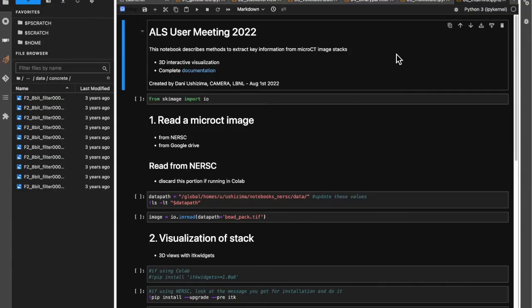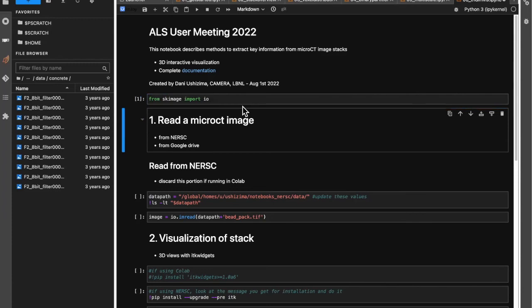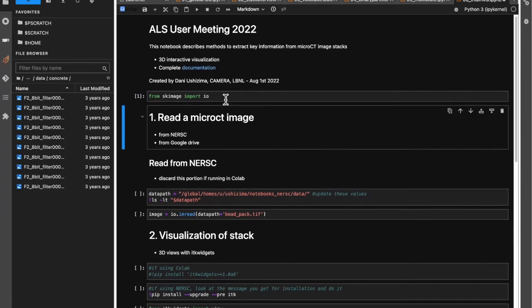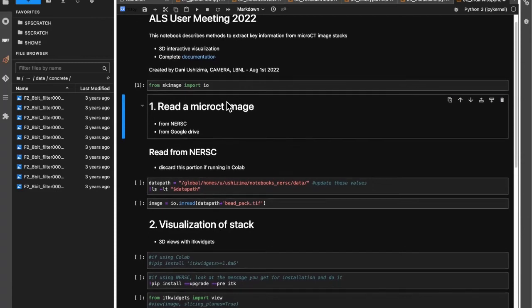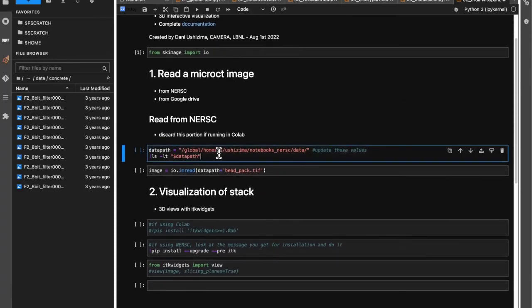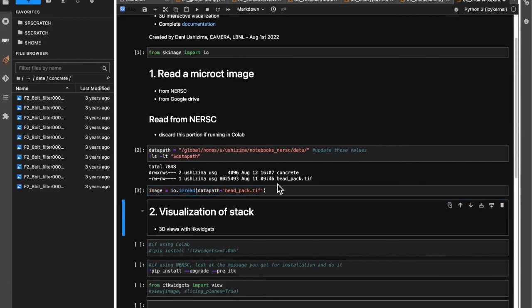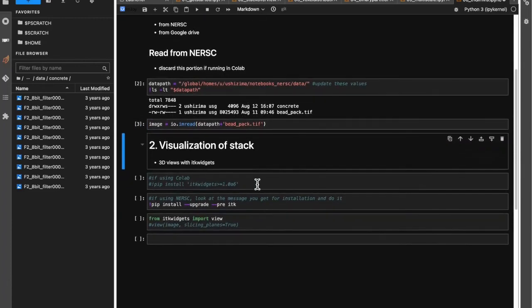Finally, we're getting to the 3D visualization, and I'm leaving you a link for all the documentation. There are so many things you can do using ITK widgets. Here I'm using scikit-image to read the image — you could also use ITK for that. But because I've used scikit-image throughout the tutorial, I'm going to keep it this way. Now I'm going to read my bidpack and go for the visualization.